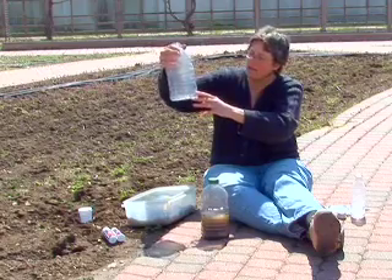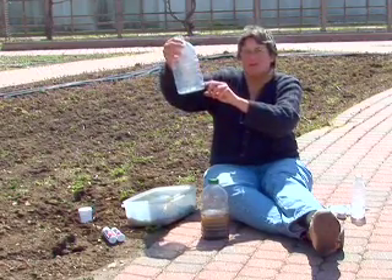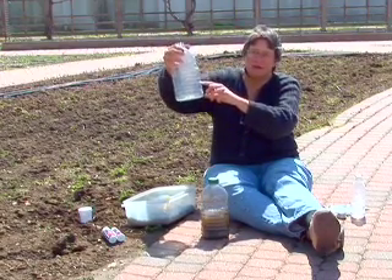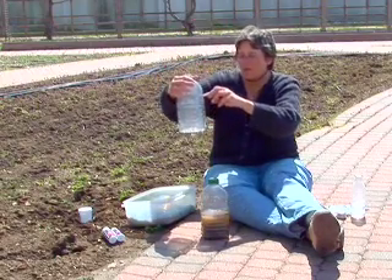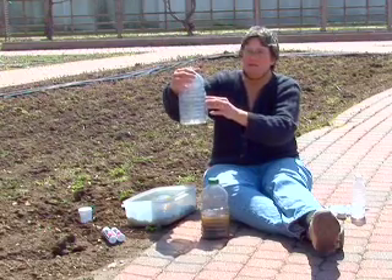As you watch it settle, in 30 seconds you'll see the sand come out first — those are the largest particles. In 30 minutes you'll see the silt layer come out, that's your medium-sized particles, and then over the next 24 hours as the water clears up you'll see the clay settle out.